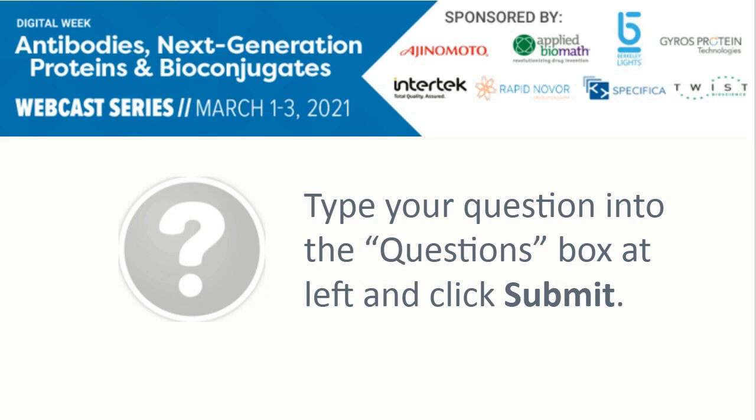Indeed, yeah. Hopefully I answered this to some extent in the last reply, but indeed, we could work with multiple different signal peptides and then find the best one for our purposes, right? This is always the nature of the question: what is the best one? I'm happy to hear you tell me why an antibody sample is the best one for your application. Of course, when we do the assessment in our hands, we're always assessing the best one with respect to sequenceability. That's not necessarily going to be in congruence with the highest possible affinity, although of course the platform yields high affinity binders because of the inherent affinity purification bias. Yep.